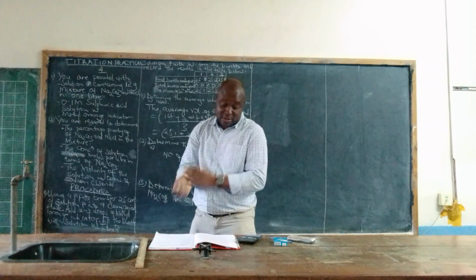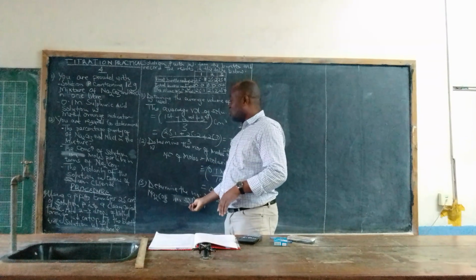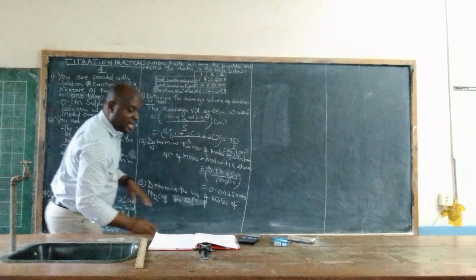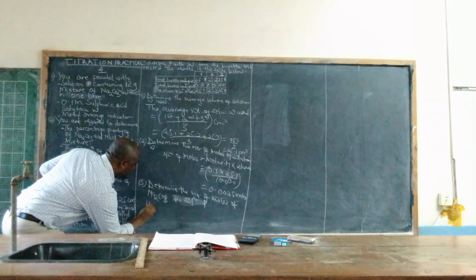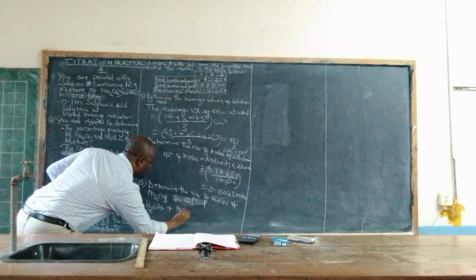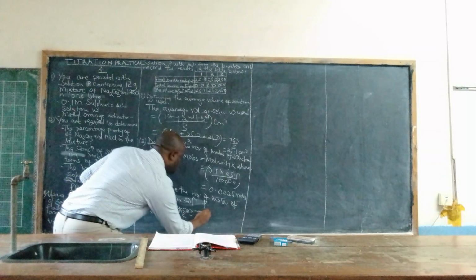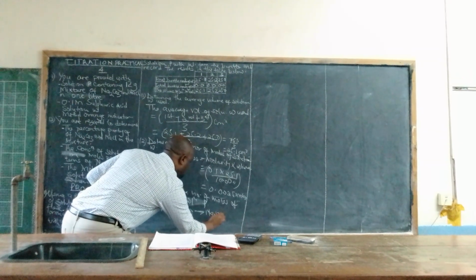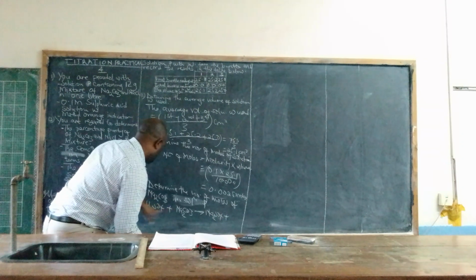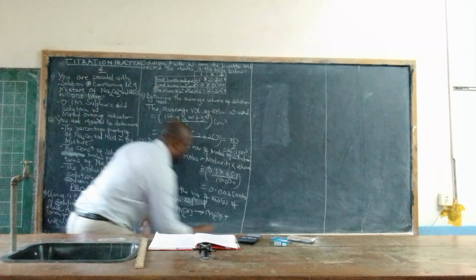These short remarks, in the long run, we must approach it this way. Here, we must write the chemical equation first. So, we are going to write the chemical equation. Sulphuric acid plus sodium carbonate. It's going to give us sodium sulfate plus carbon dioxide plus water.